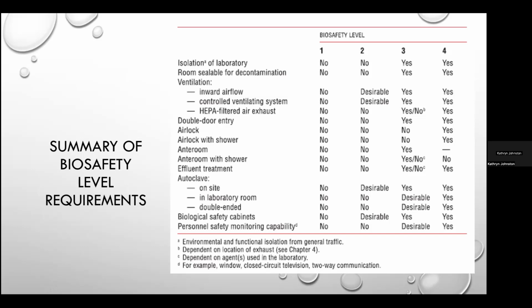As an example, in a biosafety level 2 facility, some tasks may necessitate biosafety level 3 because the procedure might produce high concentrations of aerosols. So you might be in a biosafety level 2 with some biosafety level 3 processes going on that are going to require additional types of equipment.